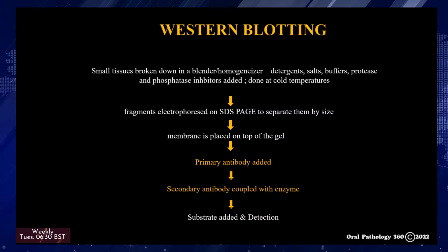Western blotting. The proteins of the sample are separated using gel electrophoresis. Separation of proteins may be by isoelectric point, molecular weight, electric charge, or a combination of these factors. The nature of the separation depends on the treatment of the sample and the nature of the gel. This is a very useful way to determine a protein. The protein moves from within the gel onto the membrane while maintaining the organization they had within the gel. As a result of this blotting process, the proteins are exposed on a thin surface layer for detection.